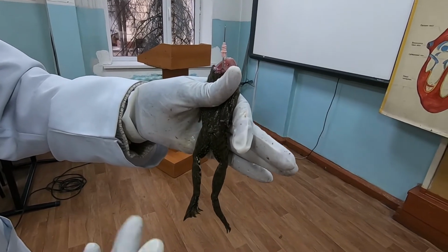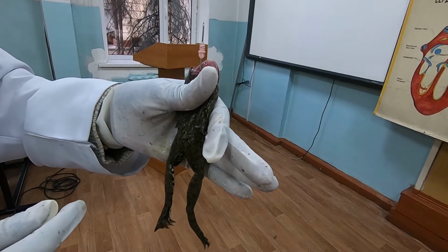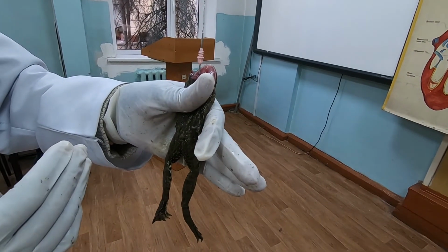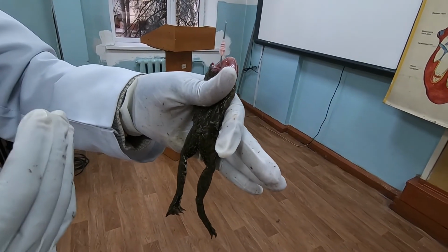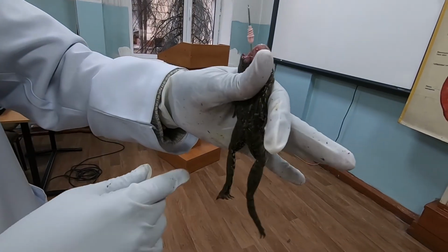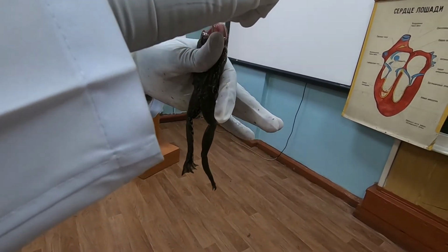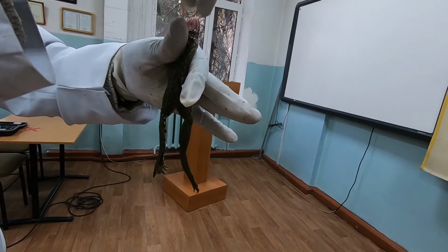If you see them on the street, this is what happens to their central nervous system. That's why we try as much as possible to take care of our back, because in our spinal cord is situated the central nervous system. So it is now completely paralyzed, finally paralyzed.